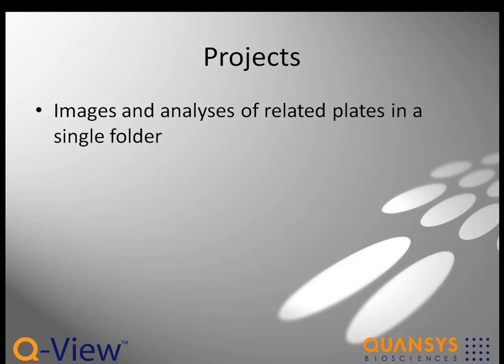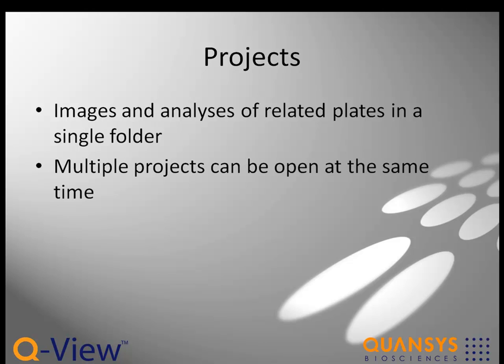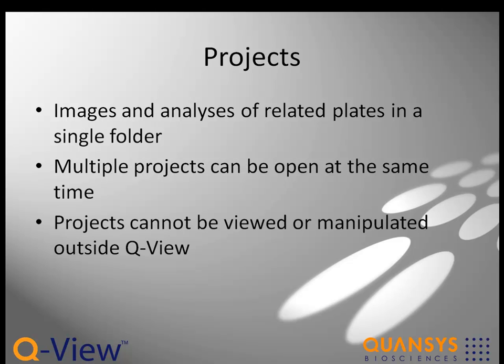As you work, changes to these projects are saved automatically. Multiple projects can be open at the same time. The files within the project folder are database files specific to QView and cannot be viewed or manipulated outside of the software.